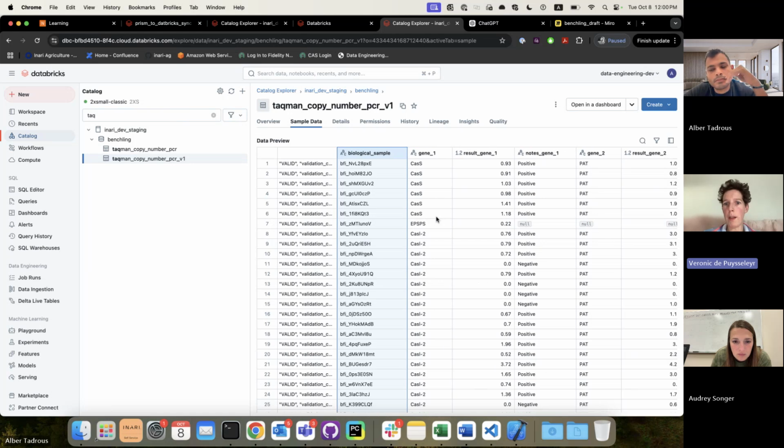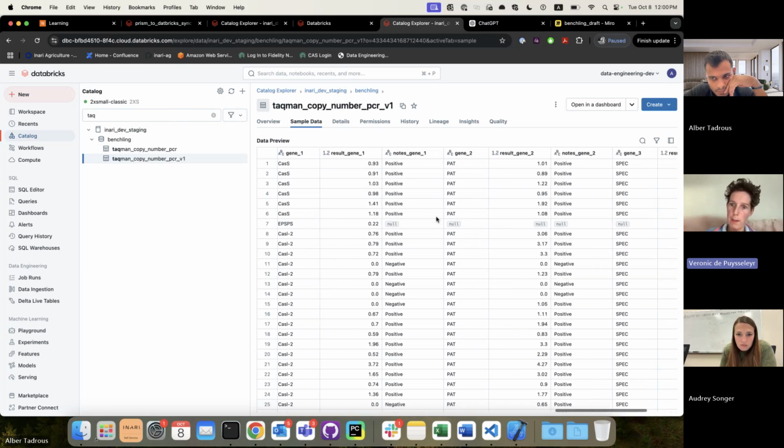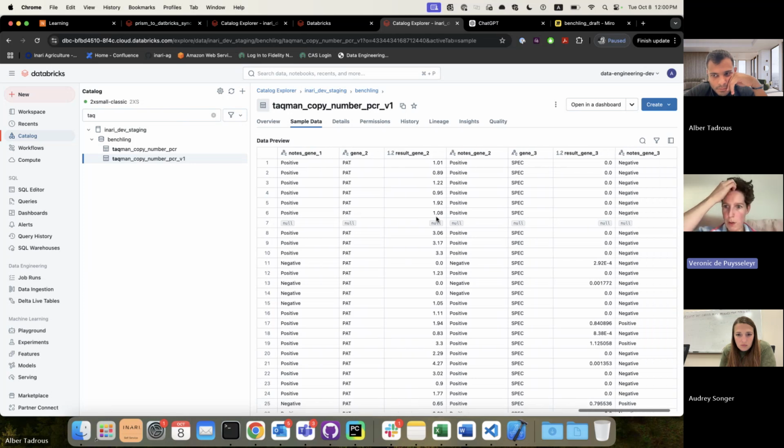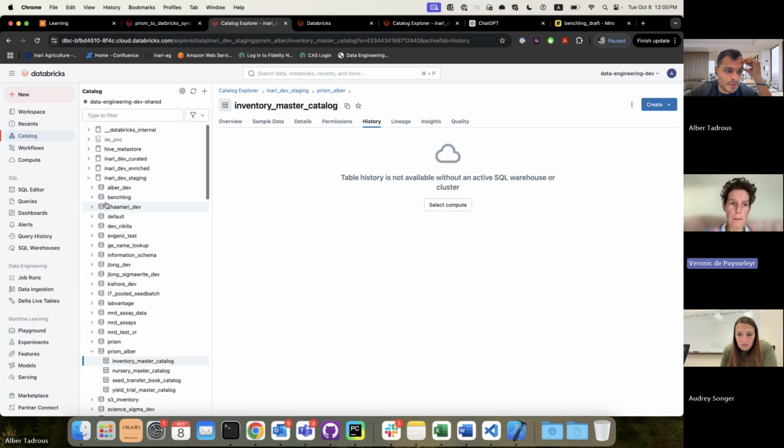In one row, you can register results on three different genes, on three different elements of the transgene. Do you remember the threshold? They said if it's a value above 0.5. Yes, it is calculated on top of the copy ratio. Let me just open it here. You can put logic there.